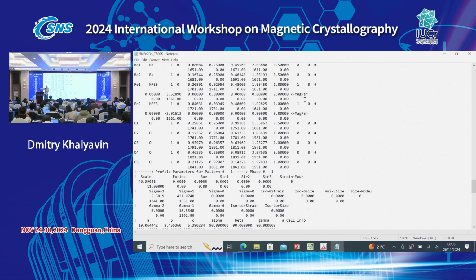That is one of the ways you can eliminate it, because very often you don't get a physically sensible number. Or you can try to do absorption correction when you process your data. But again, you need to know the geometry of your sample very well. You need to know the sample size, and usually we run this kind of sample in a double wall can.